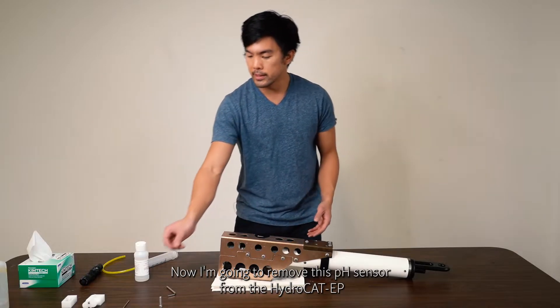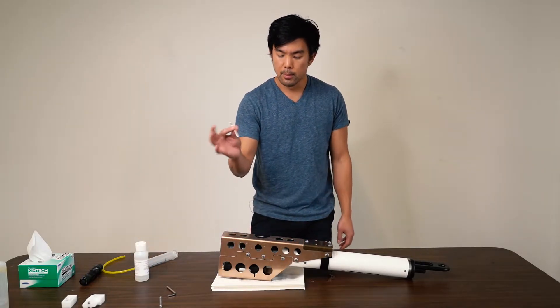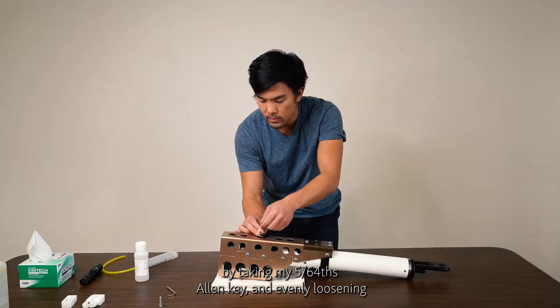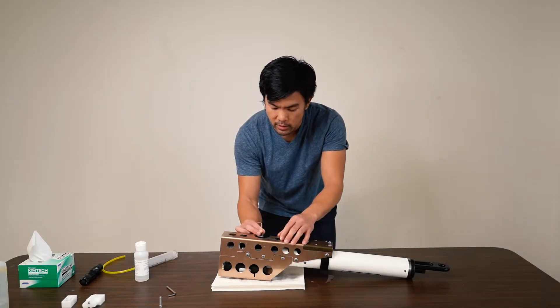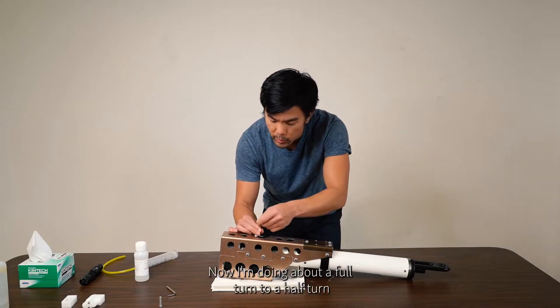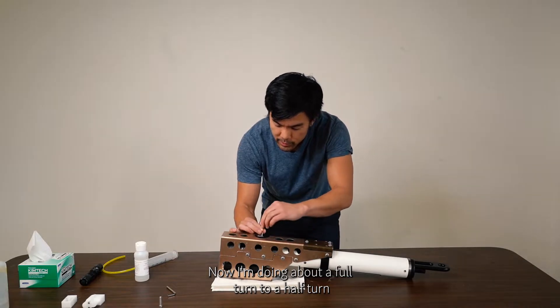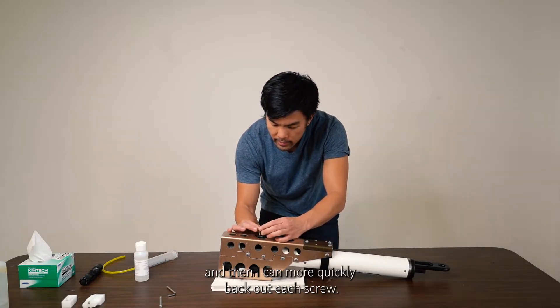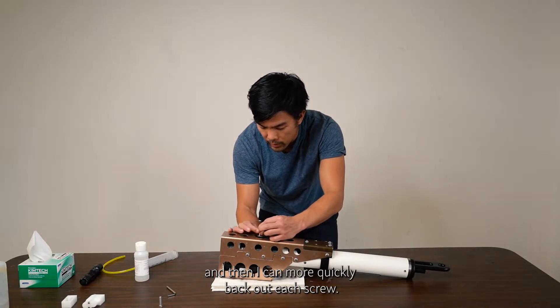Now I'm going to remove the pH sensor from the HydroCat EP by taking my 5/64ths Allen key and evenly loosening the two captured screws that hold it in place. I'm doing about a full turn to a half turn each time until I feel it loosen.